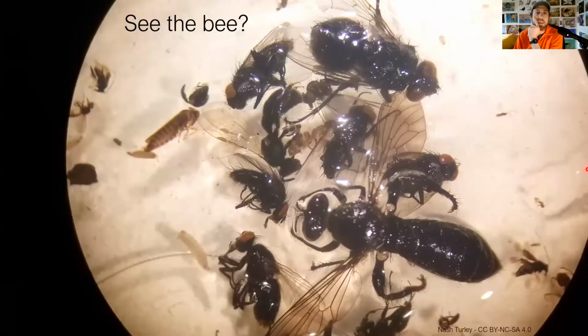Okay. See a bee in this photo? These are all photos that I took through a microscope, so they're not great, but it more represents what you would potentially see. So we got a bee right here. Probably a little Lasioglossum again.